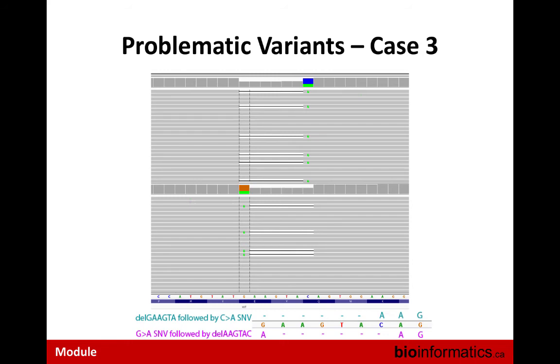It could have been entirely random chance, although I think it's more likely to happen on the NextSeq, because when you run things on the NextSeq or other sequencers that have multiple lanes, the sample is split across the lanes. And in this case, we processed each individual lane, and only one lane has the alignment that's at the bottom. But it was processed multiple times. It never changes. It's always the same, and somehow it overwhelms the other, and it becomes this.